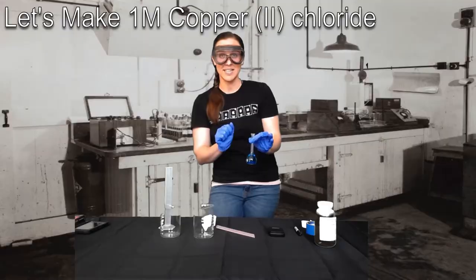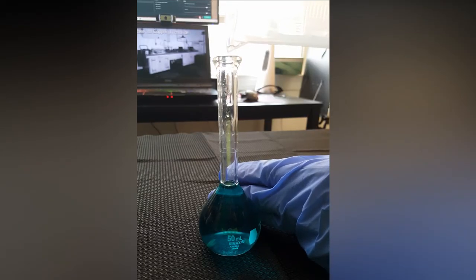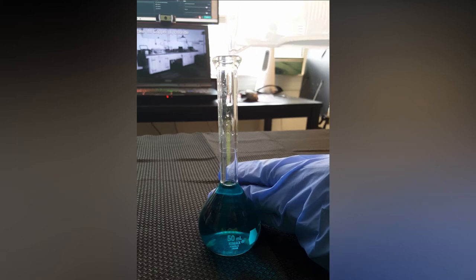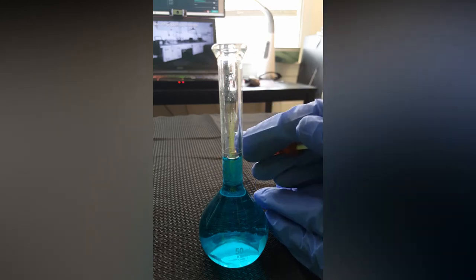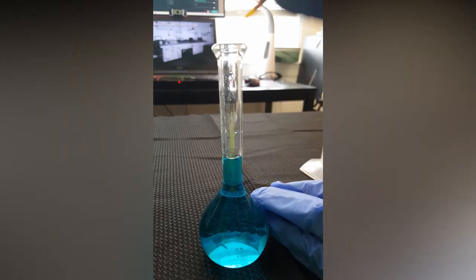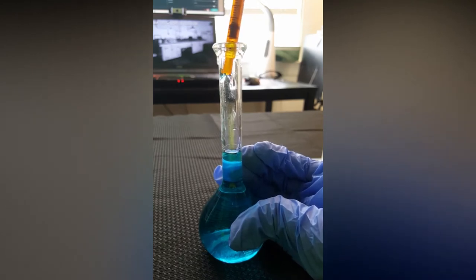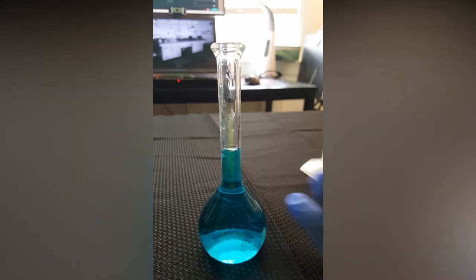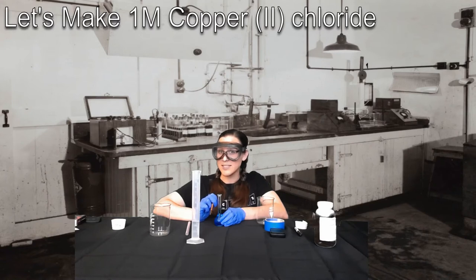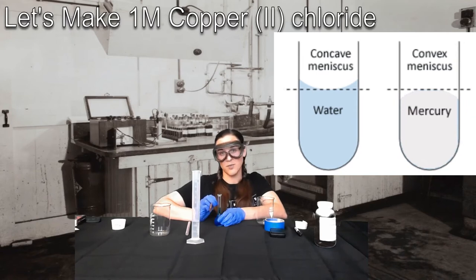So it's at this point that you want to add enough DI water to get to that line very slowly and very carefully. When you get close to this line, you're going to want to use something with smaller volume increments so that you don't overshoot it. Now remember, when you're trying to get a precise volume, you need to read it from the meniscus, i.e. from the bubble that's created due to the adhesive effects of water on glass.